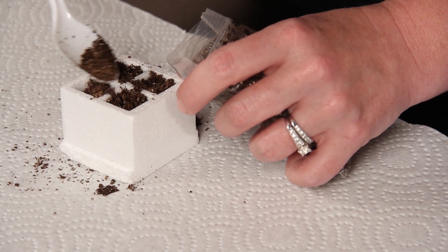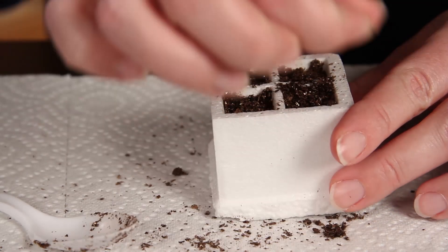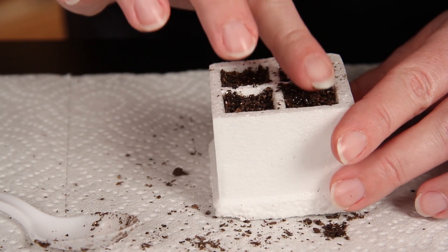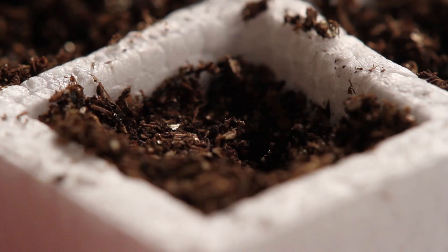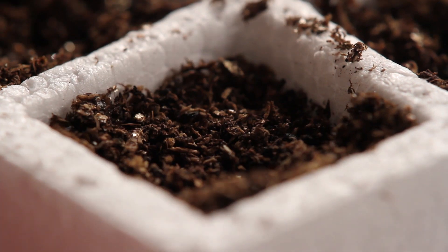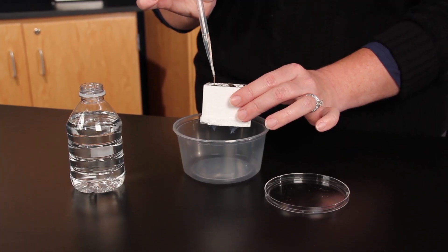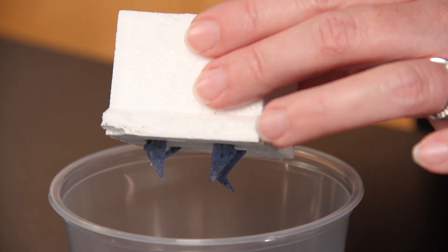Make shallow depressions at the top of each cell. Make sure not to press hard or compact the soil. Add two to three seeds to each cell. Cover the seeds lightly with soil. Add water to each cell with a pipette until water begins to drip from the wick.